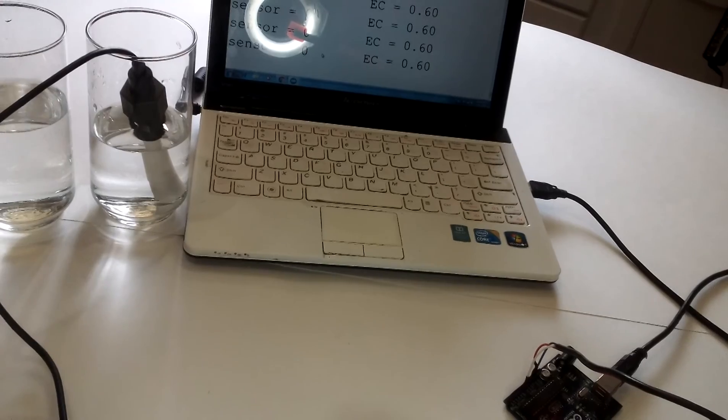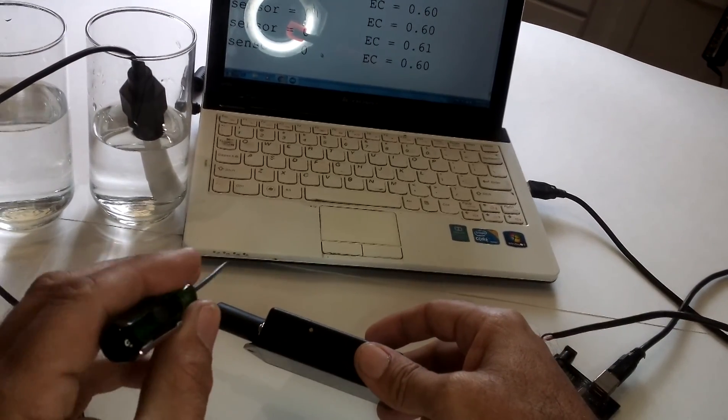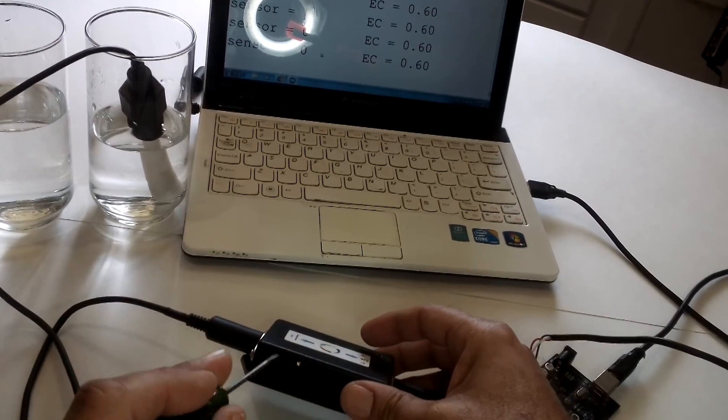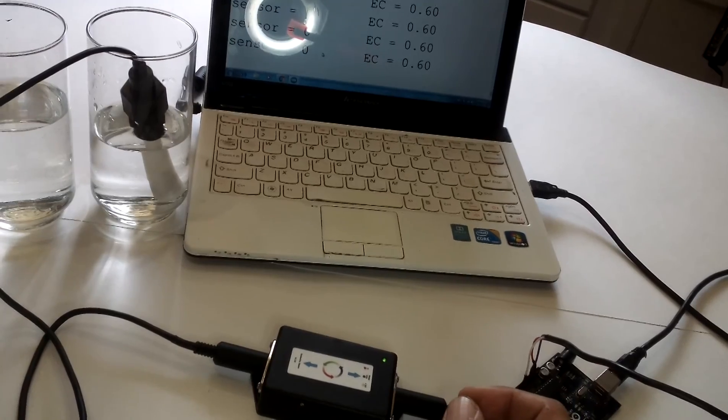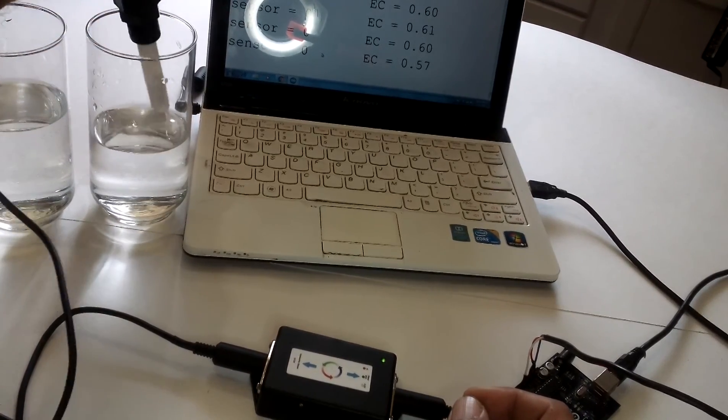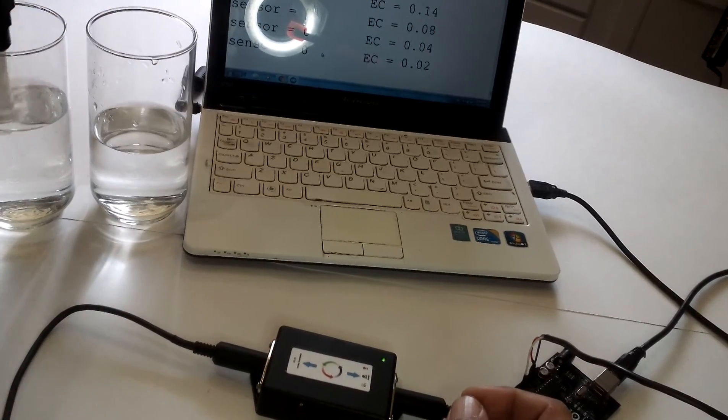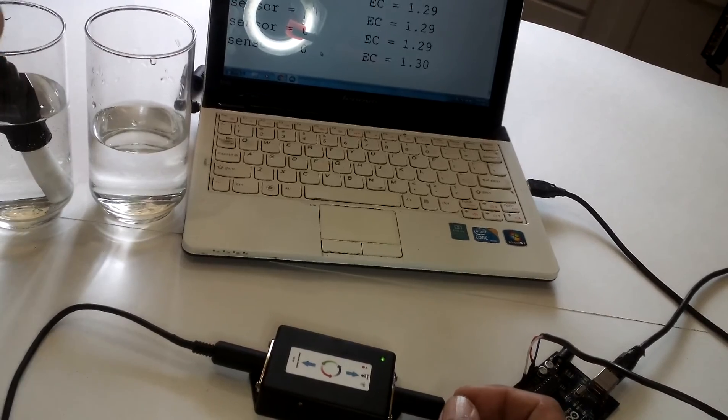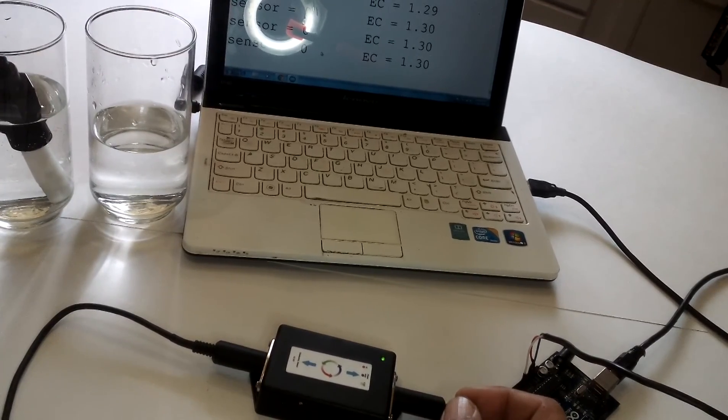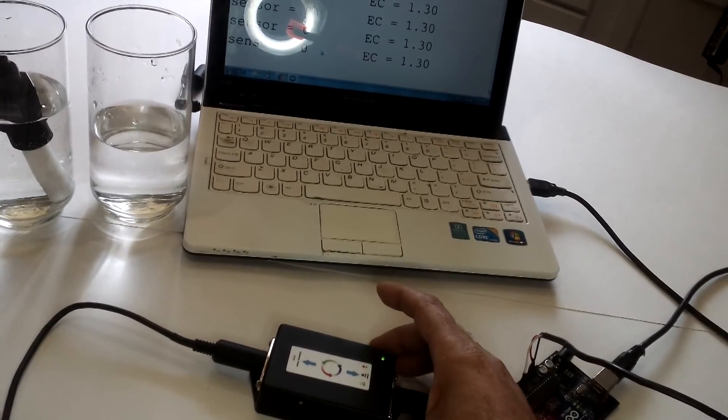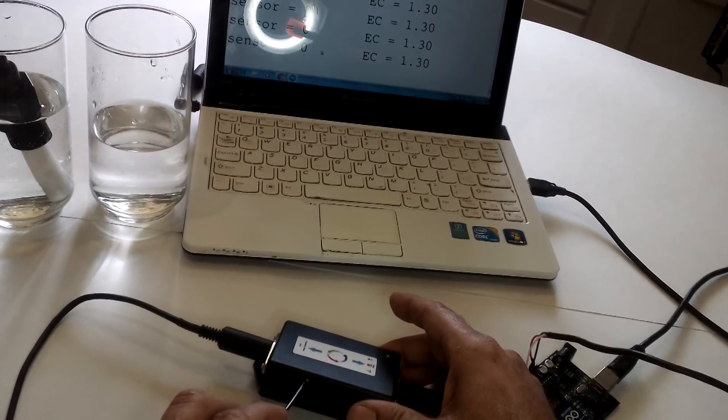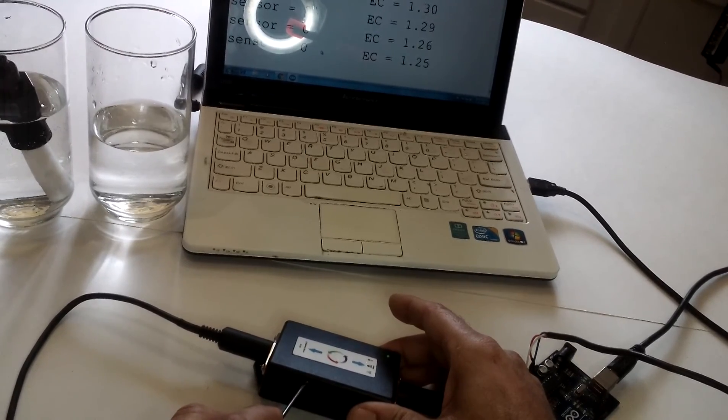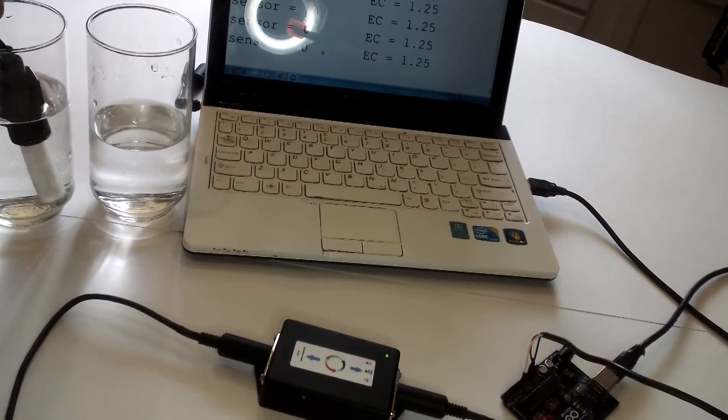And if you need to calibrate then you may use a screwdriver, a flat screwdriver and you can manipulate the numbers for fine tuning. Now let's put the sensor in a known solution of 1.25. And it's actually reading 1.3, 1.29. And let's adjust to match to 1.25. There. 1.25.